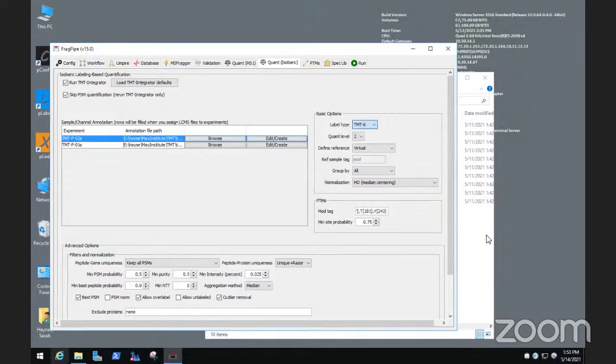So at the moment, we don't have the ability to enter specific corrections that you receive for each kit. But in our benchmarking against tools such as Protein Discoverer or SpectroMine or some other tools that do have this correction, or MaxQuant, performance was really great without that correction. In several scenarios, we identified data sets where other tools were applying the correction that was only creating artifacts in the data, especially when it came to highly differential proteins.